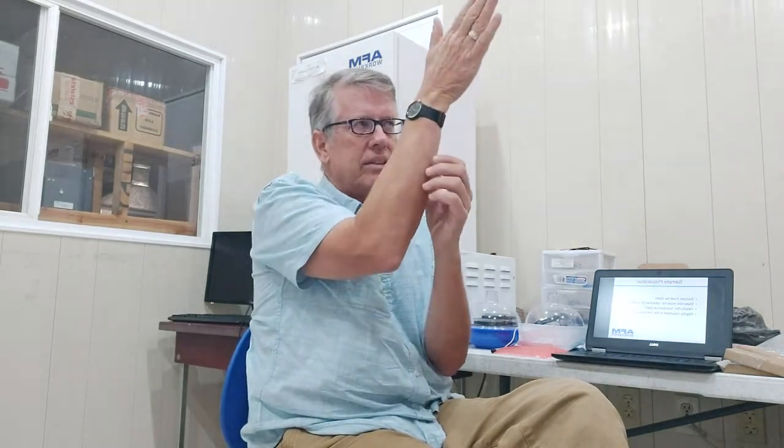A lot of times students get lazy and they'll just stick the thing in there without attaching it down. I had a customer the other day looking at a nanoelectronics sample. It was a line and had these wiggle marks over it. I said you have to make sure the sample's rigidly mounted. They just put the sample in and didn't tape it down. So anyway, those are the primary things.